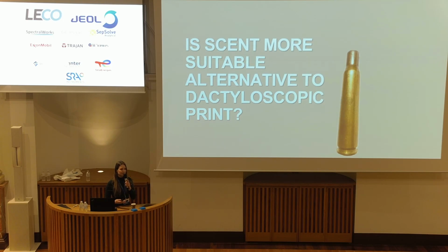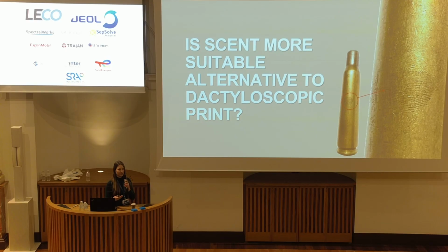So often you can find on the crime scene cartridge cases with a dactyloscopic fingerprint. Unfortunately, it is often partial, so there are not enough minutiae to be able to do proper individual identification. So the scent could be a suitable alternative to do a proper individual identification of the shooter.